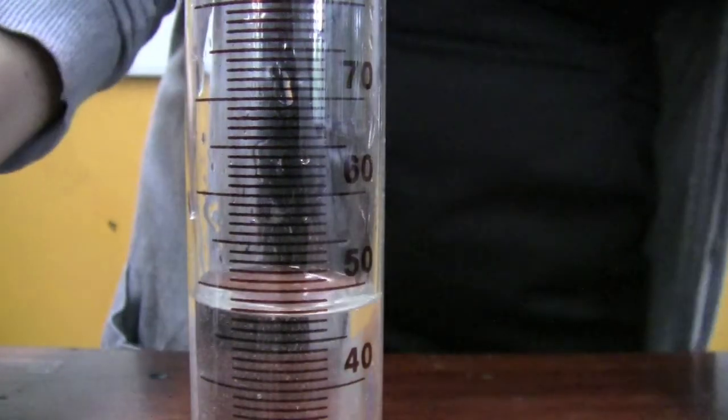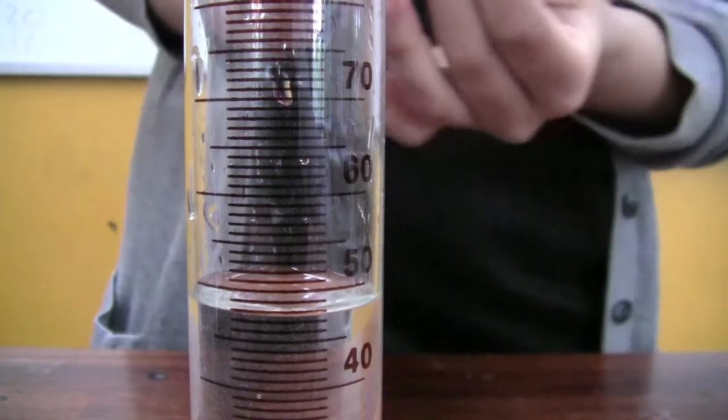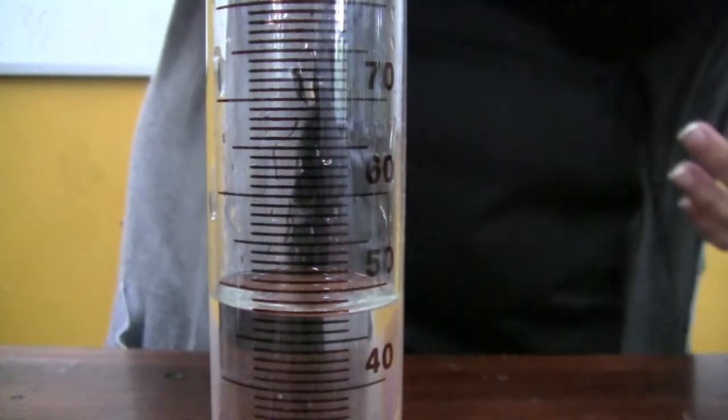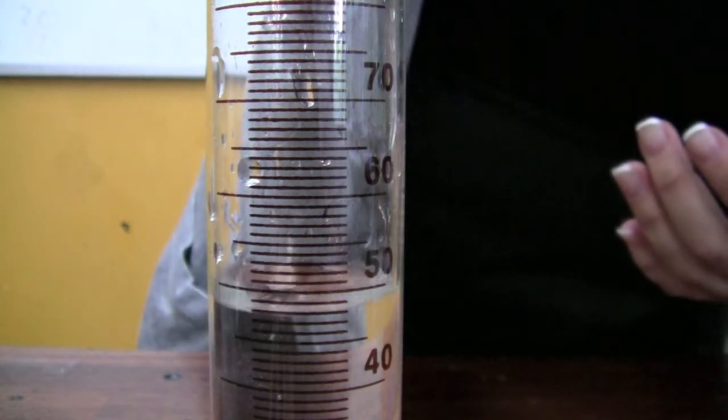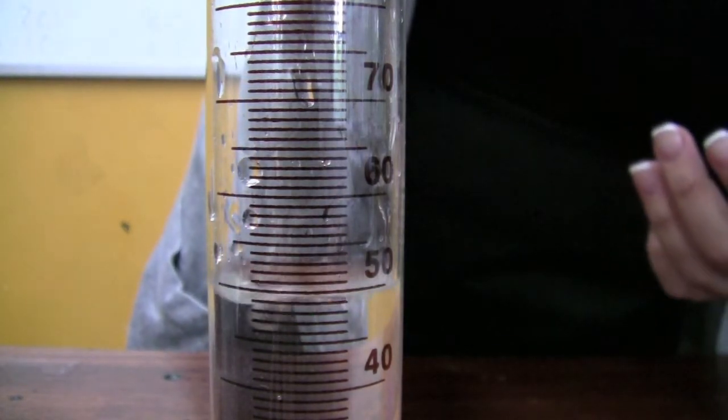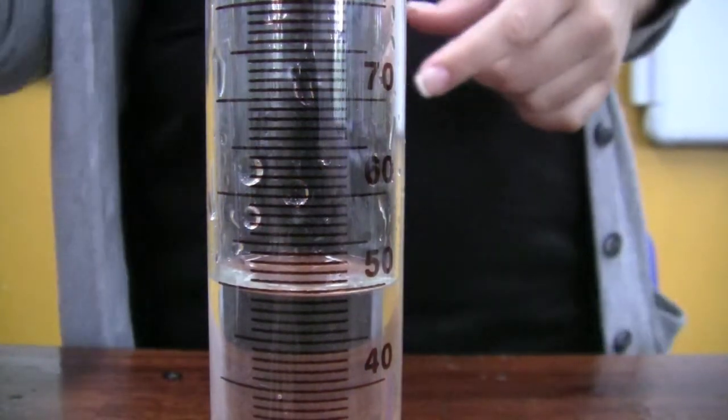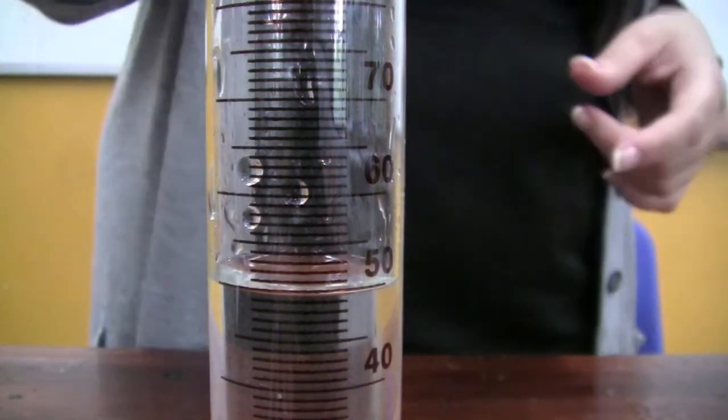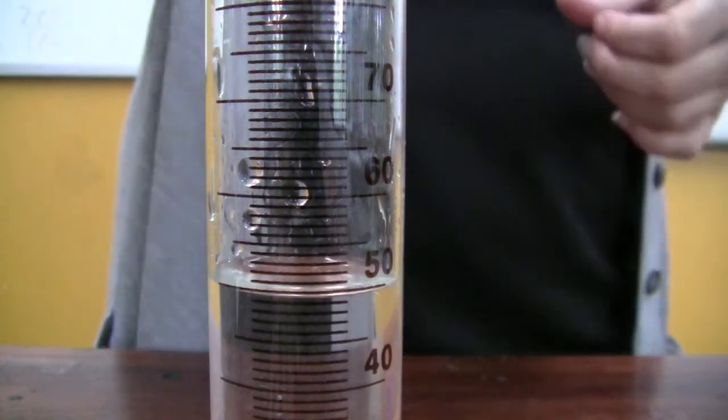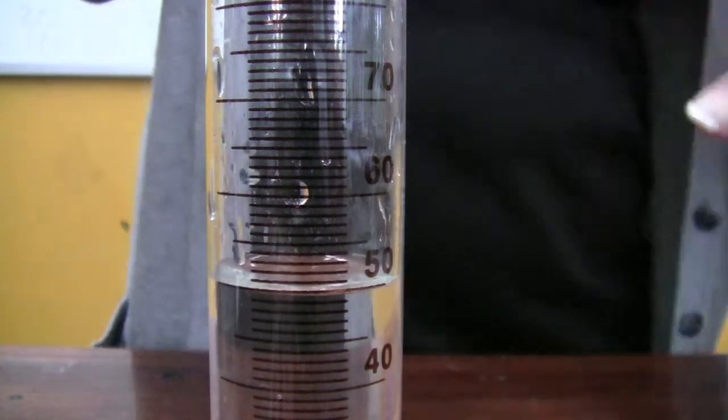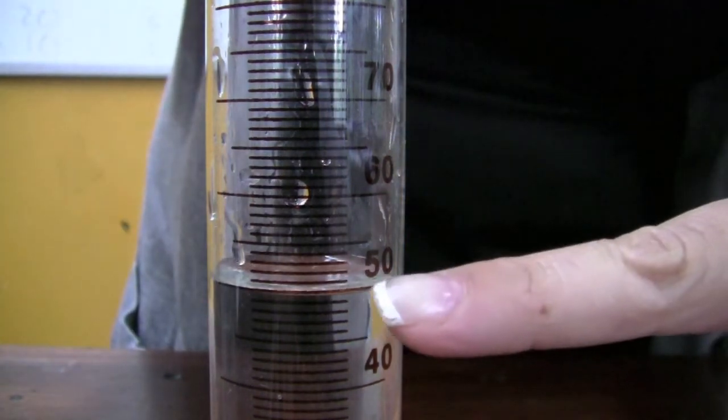When I get close to 50, I'm going to stop and use the pipette. And put it in carefully, drop by drop, until the meniscus is in line with the measurement on the side, with the gradient at the side.